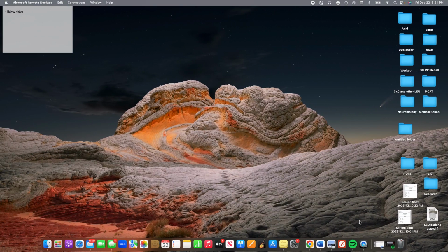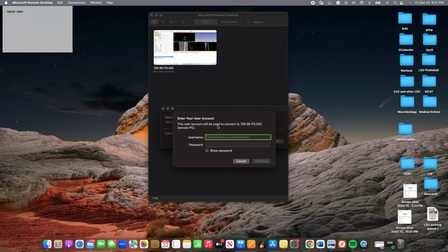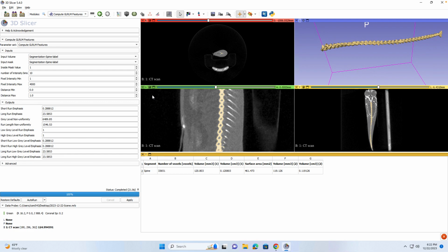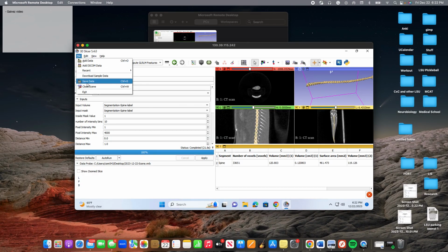Let's exit out. Oh, sorry, I actually logged out of the computer that I was using. I'll edit this part out. Okay. Yeah, so no, we don't want to exit out. What we can do is this, and it'll adjust, but we'll just exit.